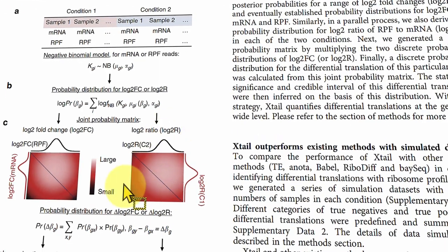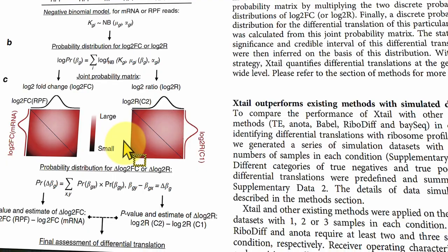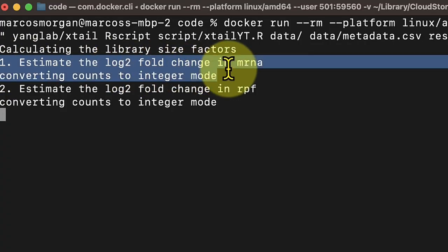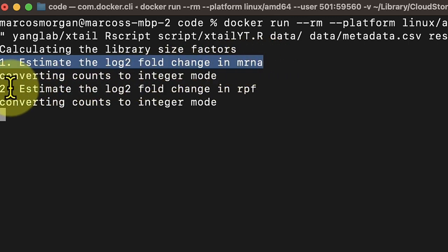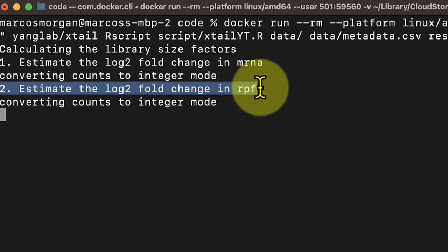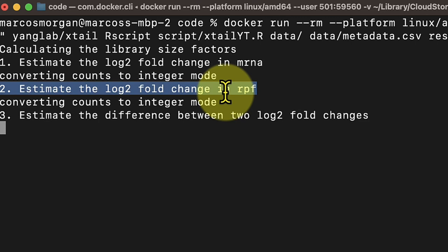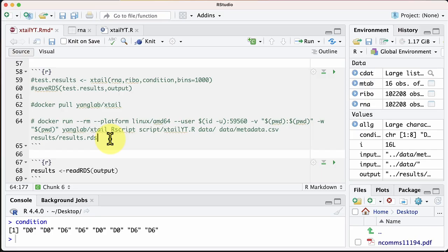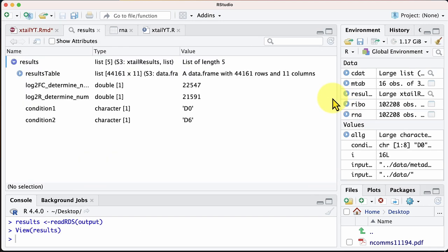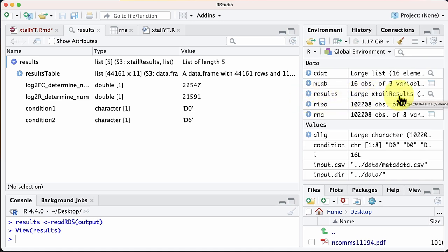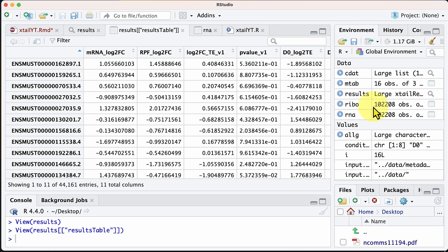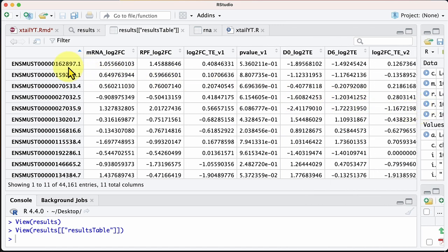The program is now running — first estimating the log2 fold change of the RNA, then the log2 fold change of the ribosome-protected fragments, and continuing with the different comparisons. The Docker script saves the data in an XTail result object. Looking into it, we have all the calculations and p-values for each transcript: the log2 fold change of mRNA, the log2 fold change of ribosome-protected fragments, and the first calculation of translational changes.